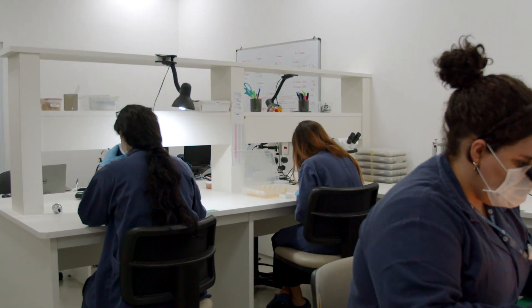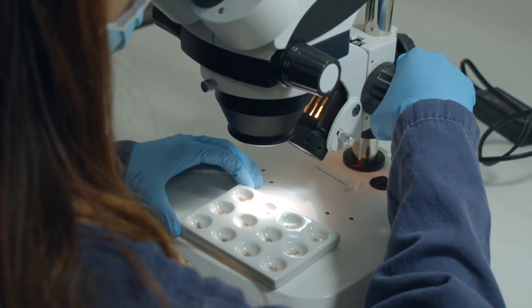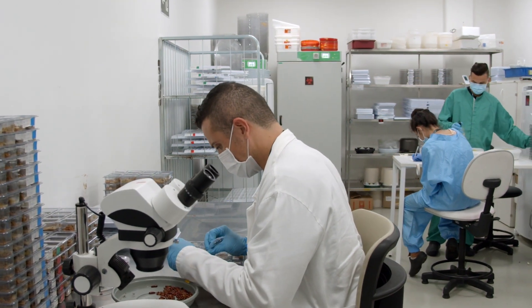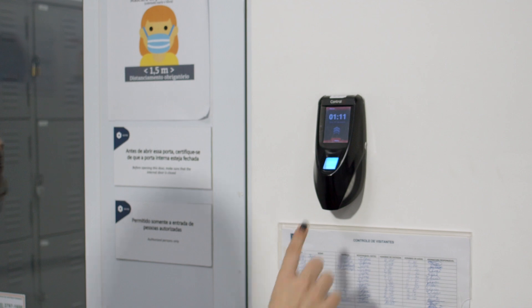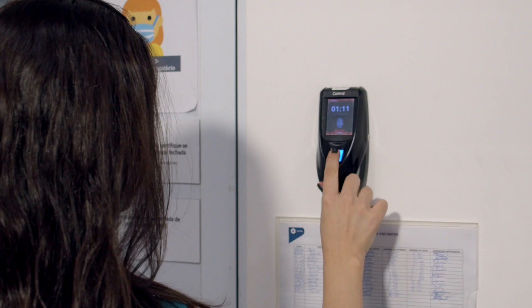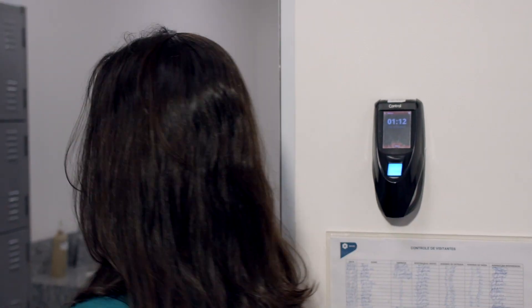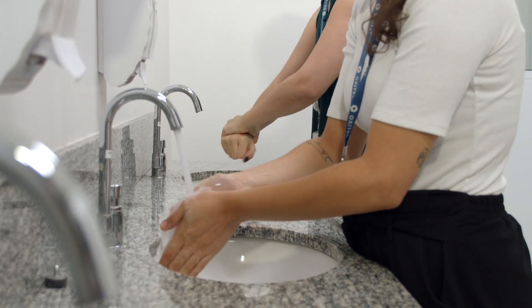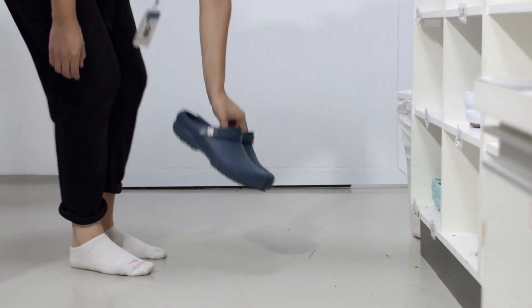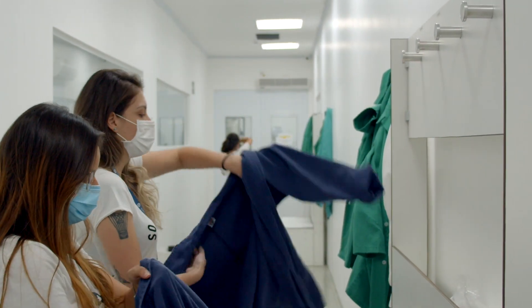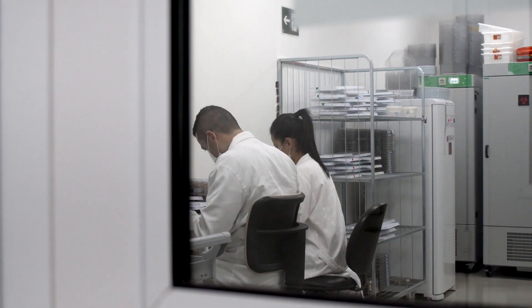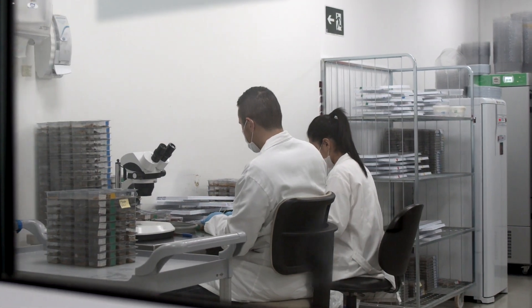After four years, we expanded our operations to include insect rearing, quality control, field deployment, and field monitoring for both mosquitoes and our new agricultural pest solutions. We also maintain a collection of wild-type insects to serve our R&D and field activities. For today's tour, we'll start at the antechamber for proper PPE wearing. Much like our UK base, our labs operate under strict health and safety conditions, and all staff are trained under the Brazilian biosafety law to perform the activity safely and compliantly. The lab is a restricted environment, and every tour needs a guide who has received extensive biosafety training.